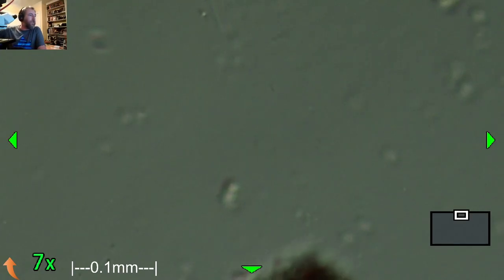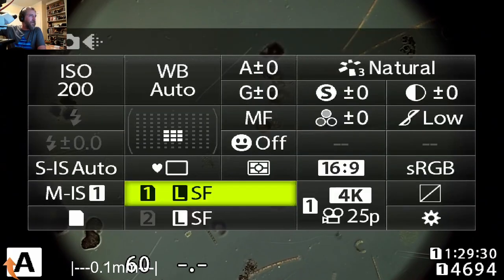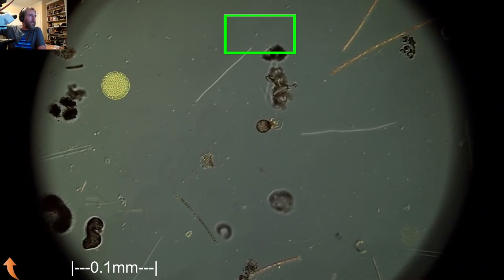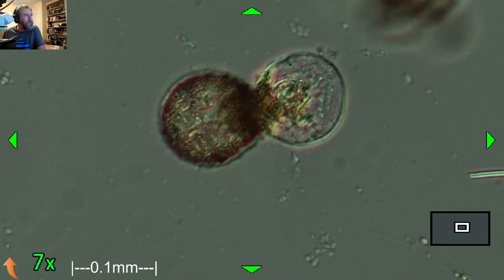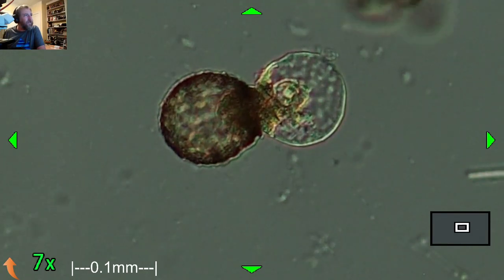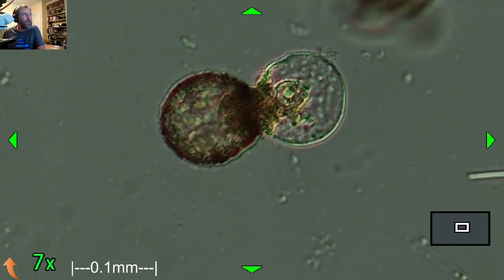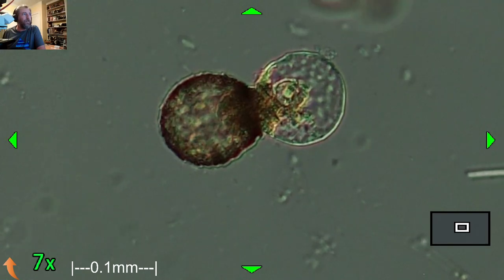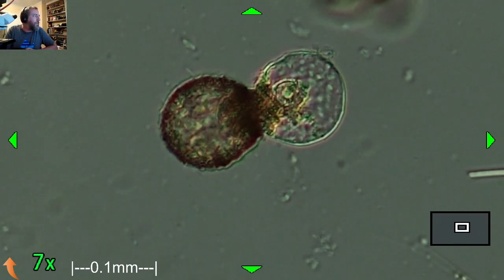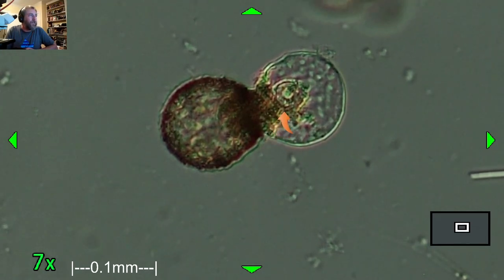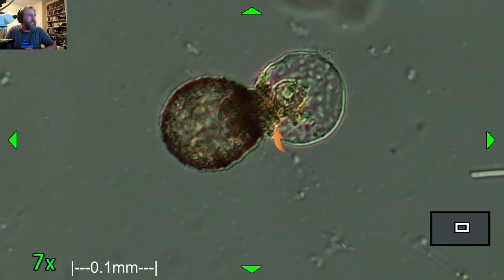And things that, diatoms that specialize on that usually will bloom directly after the cyanobacteria. And when their nitrogen gets remineralized, then the diatoms will basically take it up as inorganic nitrogen. So that's pretty cool. There's another one of these, a different type. Nature's pretty neat, yeah. Another testate amoeba. I don't know. It's got the same shape. Maybe it's making a new skeleton? Maybe that's what's going on in there? Because this is roughly the same shape as this.